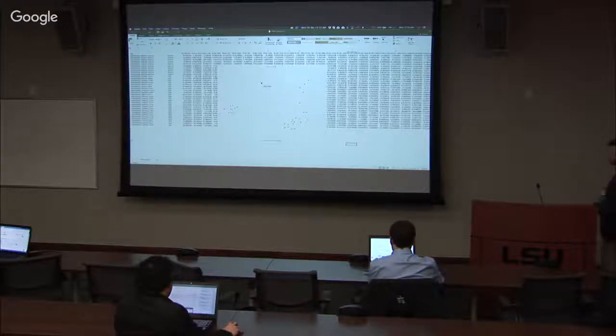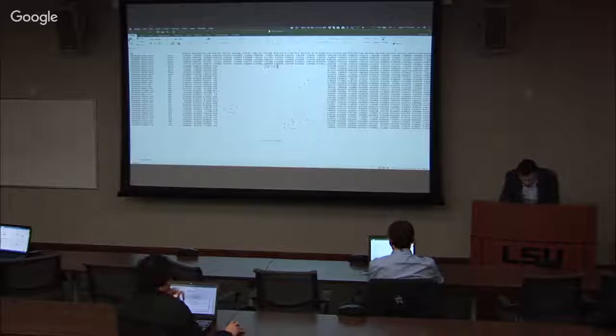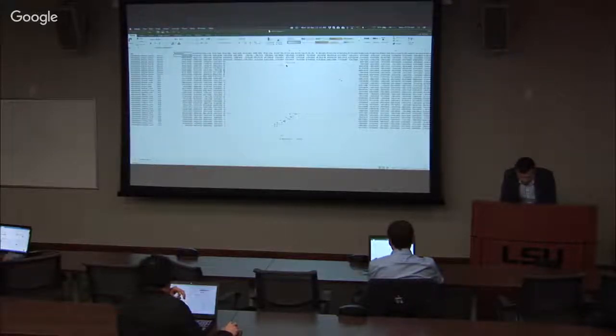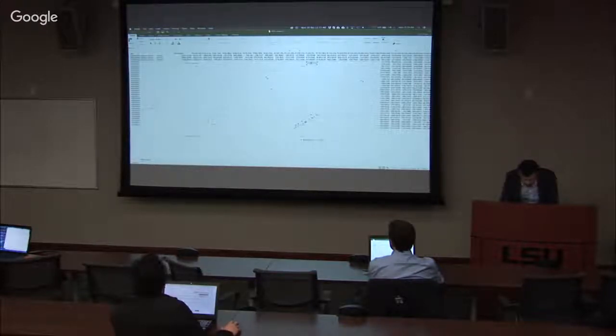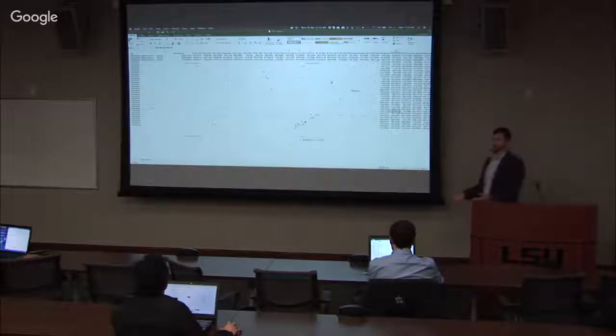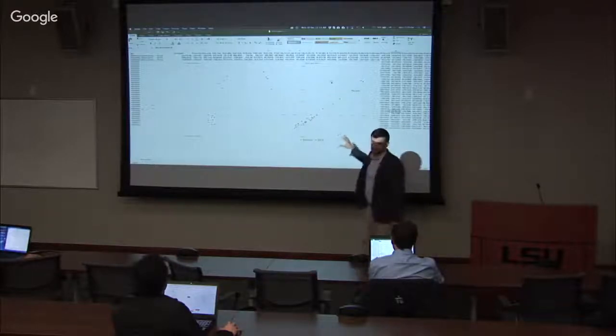So just to compare them side by side, if we take this, and I'll just write here that this is PCA of quantile normalized data. And let's take this back over here. So the previous example of raw data: if we didn't know that this is normal and this is the rest, let's say we were just examining a group of samples and you don't know anything about them, what you would naturally focus on is the difference between those and the rest, right?